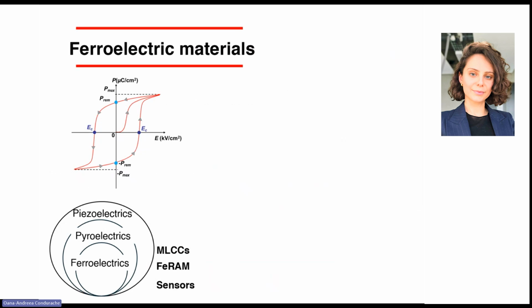So a ferroelectric is a material which exhibits a spontaneous polarization even in the absence of electric field, and this spontaneous polarization can be flipped. Moreover, ferroelectrics are a class of pyroelectrics and piezoelectrics, which open up a wide range of possible applications from multilayer ceramic capacitors, ferroelectric random access memories, or sensors.